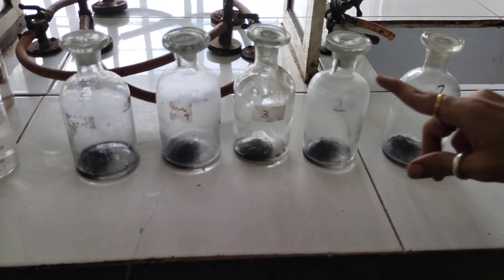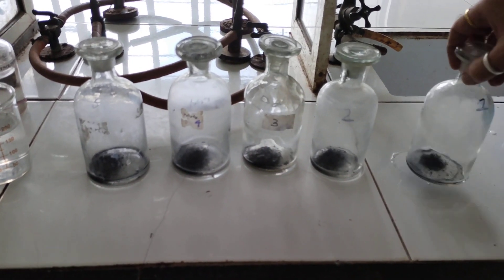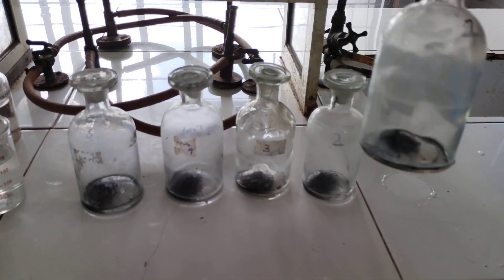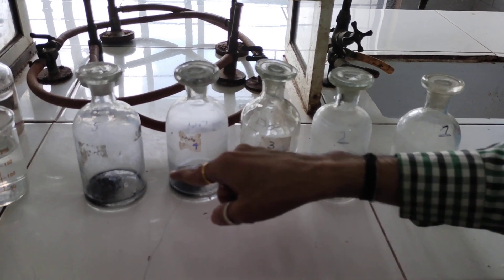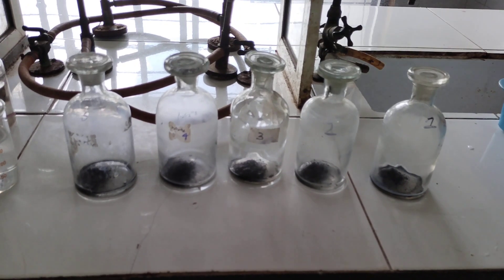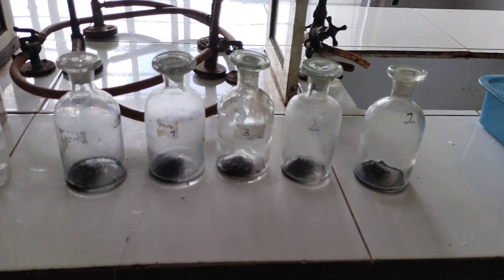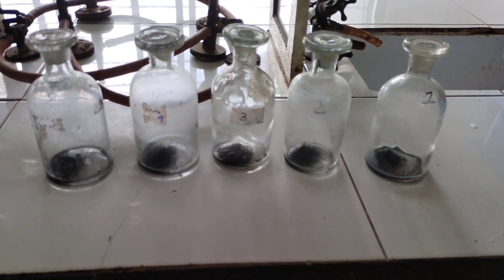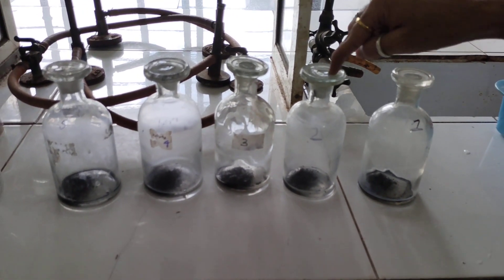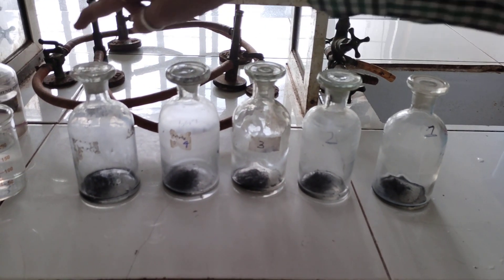I have labeled those bottles as 1, 2, 3, 4 and 5. In all the bottles I have already added 1 gram of charcoal, to which I will be adding varying amounts of 0.5 normal acetic acid. The amounts are: 50, 40, 30, 20, and 10 ml respectively.